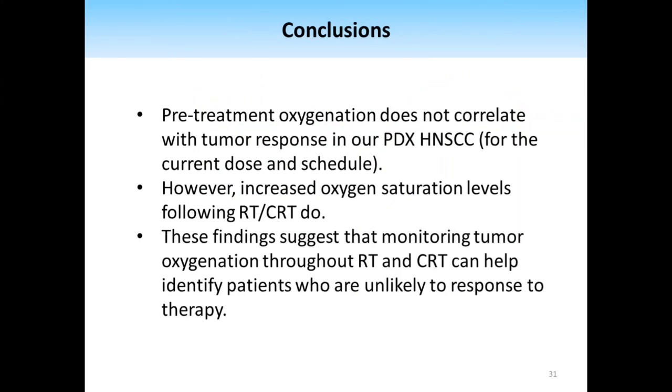But anyways, to conclude this part, unfortunately we saw that pre-treatment oxygenation levels did not correlate with tumor response in our patient-derived xenograft head and neck cancer model. And this is not completely discouraging because we only gave them 1 dose of radiation. It was a kind of high dose, and also our PDX model is an immunocompromised model, whereas most patients are not immunocompromised. So maybe there are some things that we have to look into for future studies. But what was interesting is that when we looked at the change in oxygen saturation levels following treatment, we did see that there was a correlation between response and increases in oxygen saturation.